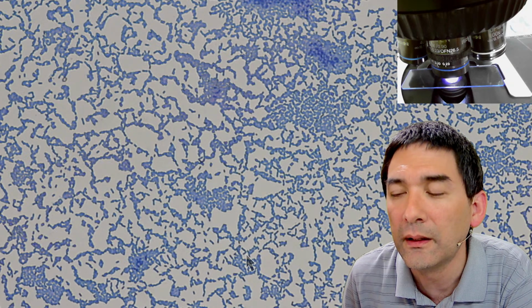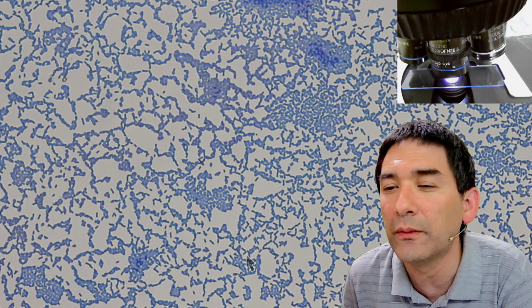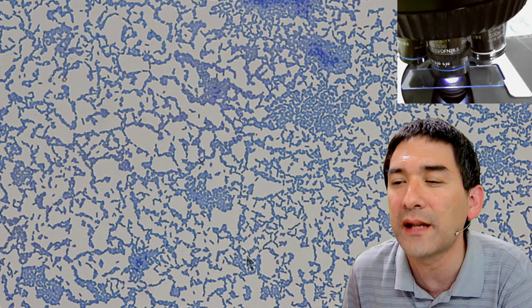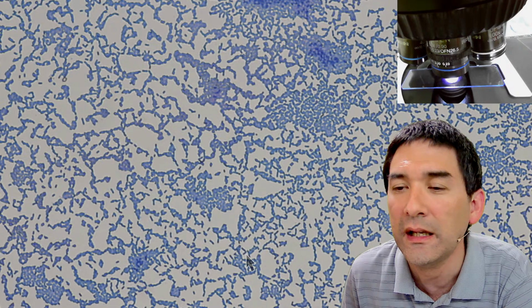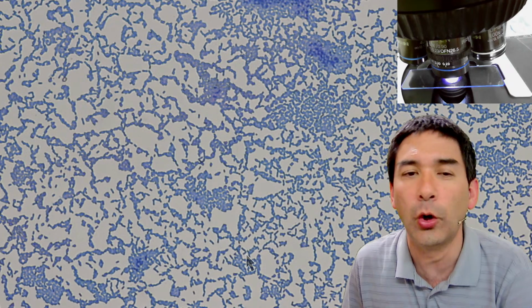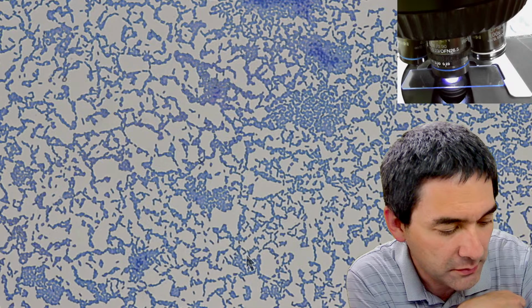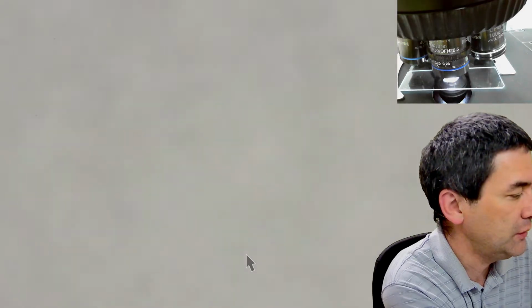What is the difference in refractive index? Is it the same as how you are able to see water in a drinking glass? So that's an optical question. Let me put another bacterium over here under the microscope. These are non-stained ones, if I'm able to find them.